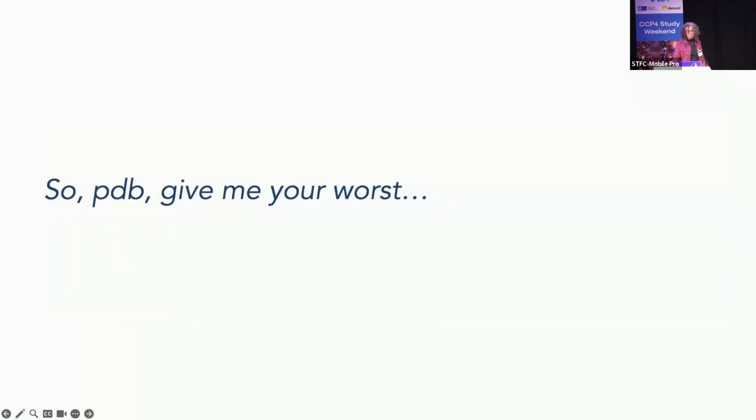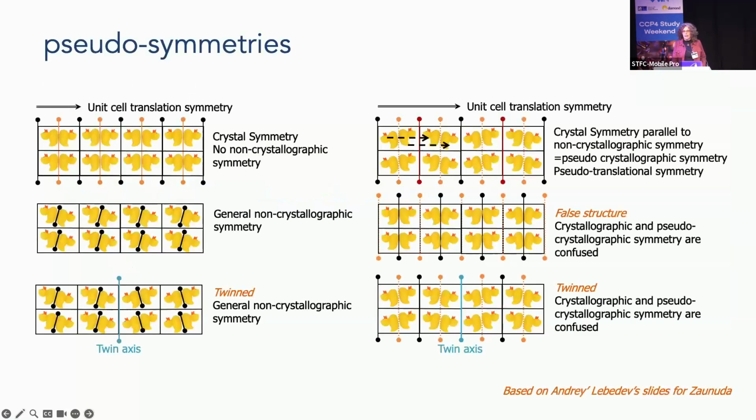That's looking really good. Look, give me some more, make it harder. What harder structures? Right, so pseudosymmetries are the hardest sort of crystallographic problems. I'm talking about the hardest. The structures themselves might not be particularly difficult or interesting even, but the problem arises specifically from the nature of the crystallographic problem. And those crystallographic problems are the hardest when there are pseudosymmetries involved in the crystal lattice.